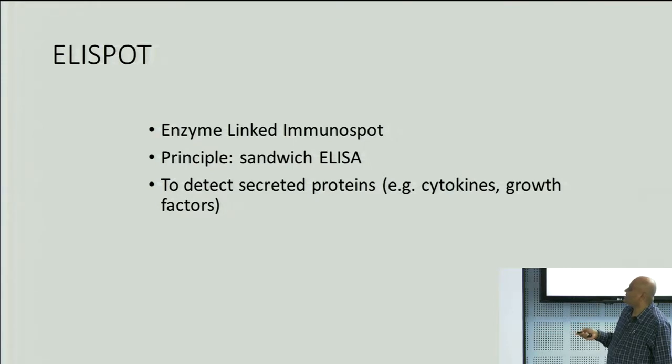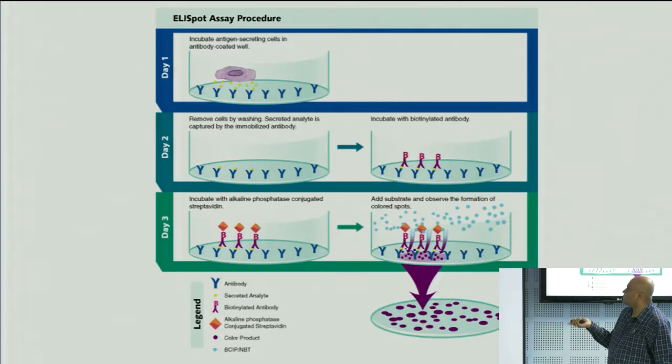Here we have changed the ELISA to ELISPOT. So what does it do? It just looks at certain spots. This is more precise than the previous ELISA mechanism. The protein goes in and gets attached to the substrate and changes color, but here it is looking at the spots. When the protein comes in, you have a number of colored spots. Instead of just one change in color, you see more colored spots generated, and that is why it is known as ELISPOT. Each of these you can quantify by finding out how many colored spots are here.